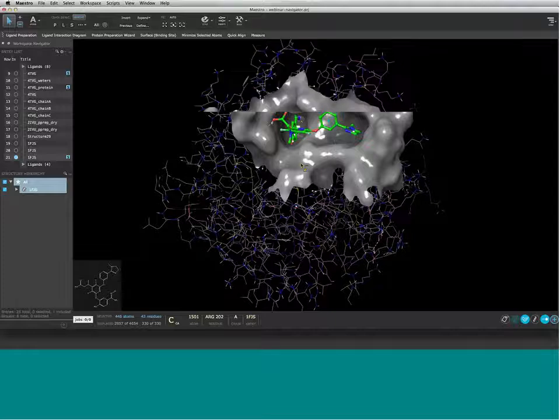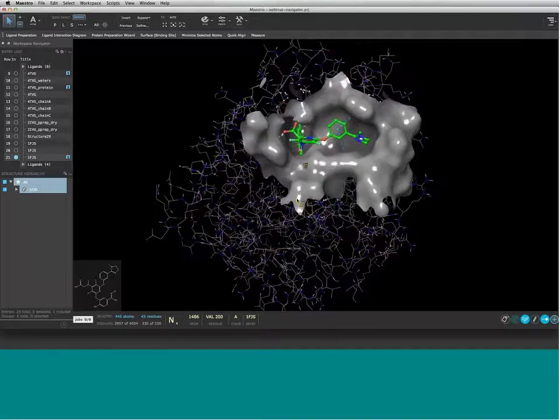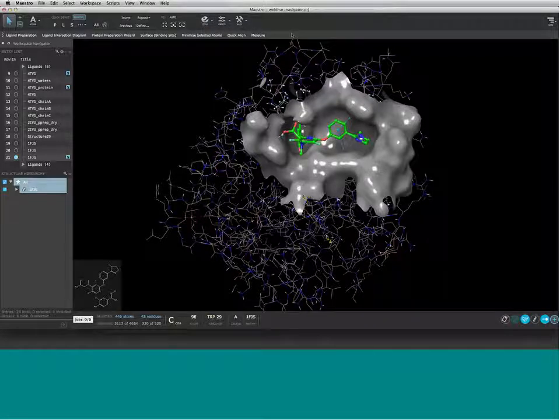Now suppose I have decided that this is a really nice selection that I did. Oh, I should show you why you have these ragged edges here. Marqueeing actually only works on visible atoms. So one thing you might need to do, because my hydrogens were hidden, is make sure that all your selected atoms are visible. And once you do that, you can marquee more effectively.